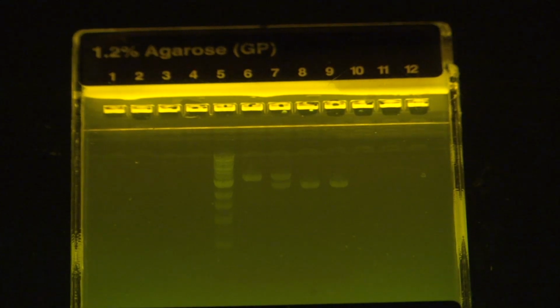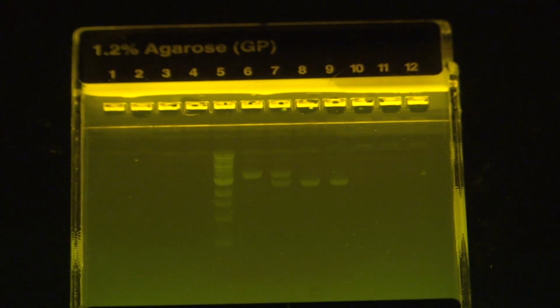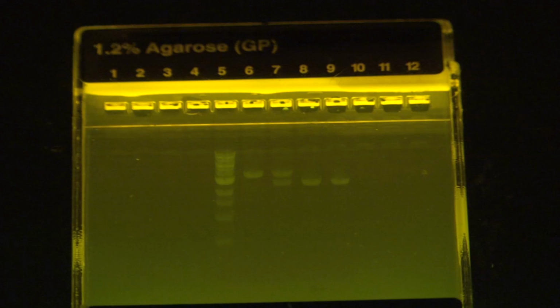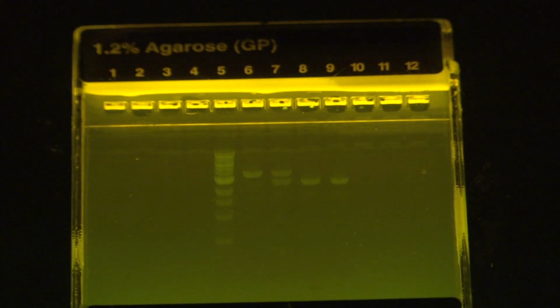Lane 5 is not a sample from a person. Remember, that's ladder that we bought from a company. So you see a series of bands of DNA. Each one is a different size, and we know the sizes of those DNA. So that's our standard. Lanes 6, 7, 8, and 9 contain the DNA from 4 different samples.